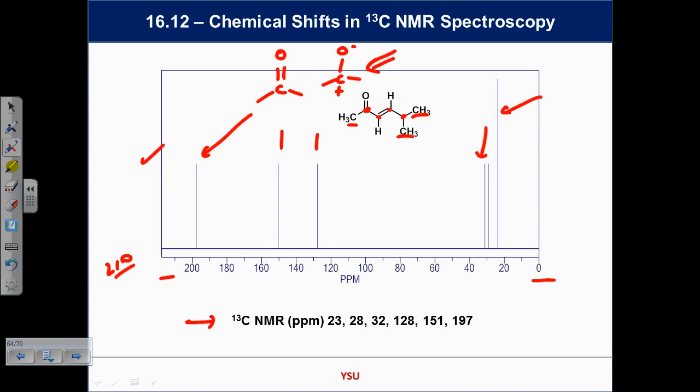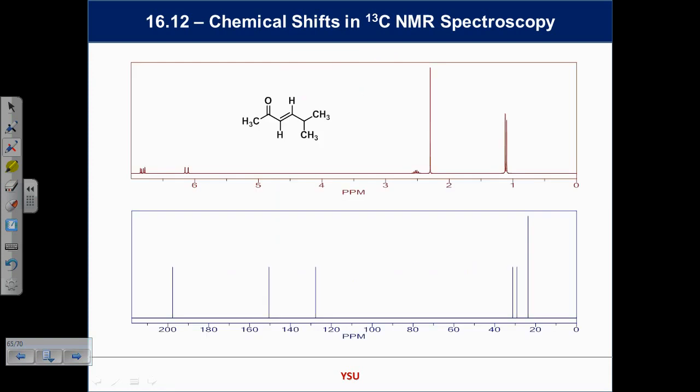So I've shown you a little bit about intensity of signals and a little bit about chemical shift. We don't spend all the time on this because we've already done the proton. These two are a comparison of that molecule's proton spectrum with its carbon spectrum. Most of the questions you need to deal with, you're going to get both. So at the top, I've got a doublet, because that's for these methyl groups, which have one neighbor.